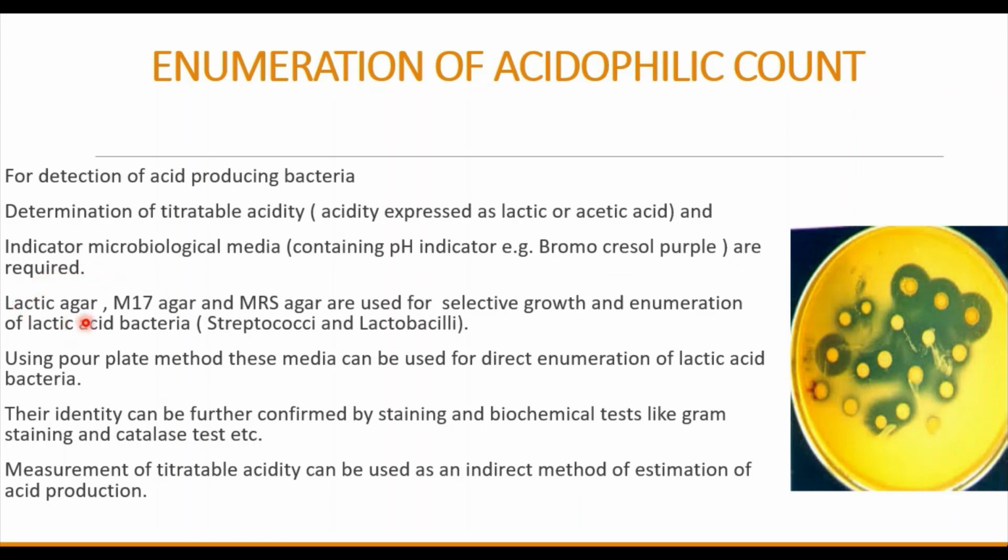Now, lactic agar or M17 agar or MRS agar are used for selective growth and enumeration of these lactic acid bacteria, mainly streptococci and lactobacilli. Using the pour plate method, these media, that is lactic agar, M17 agar or MRS agar, can be used for direct enumeration of lactic acid bacteria.